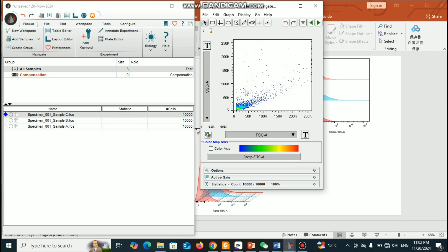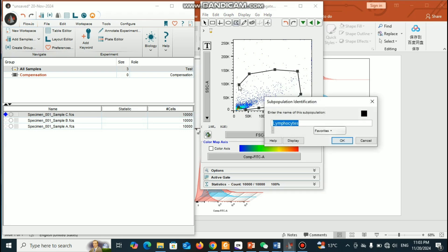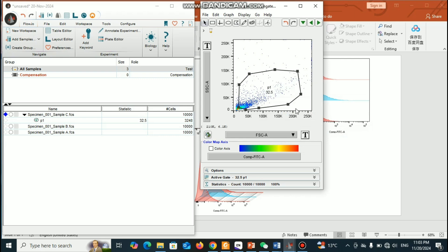Here you can see the SSC and FSC. I already talked about this in detail in my previous video, but here I just want to show something briefly — this is not my main focus. I can make this kind of data gating.